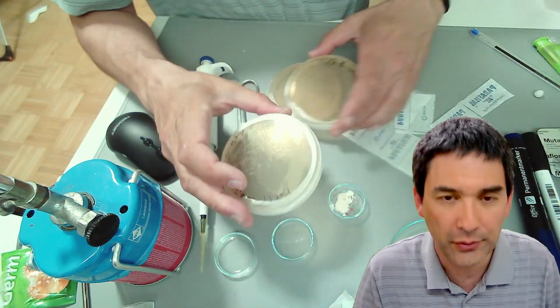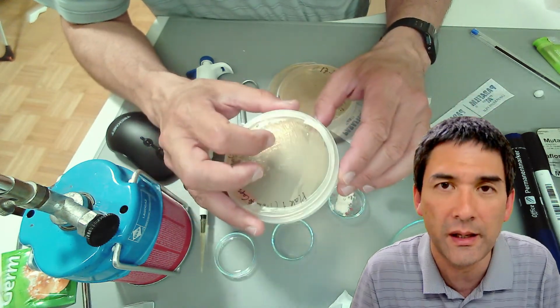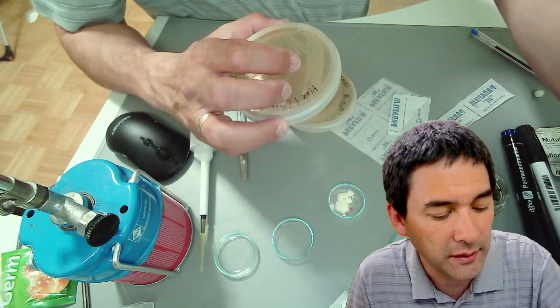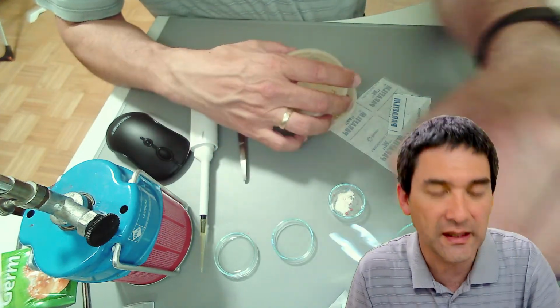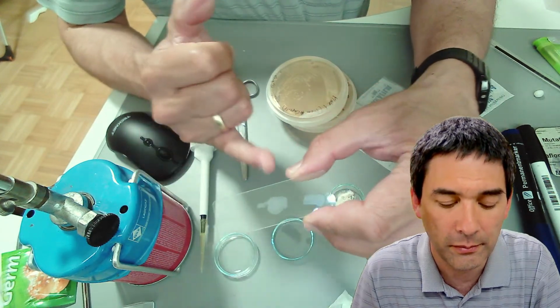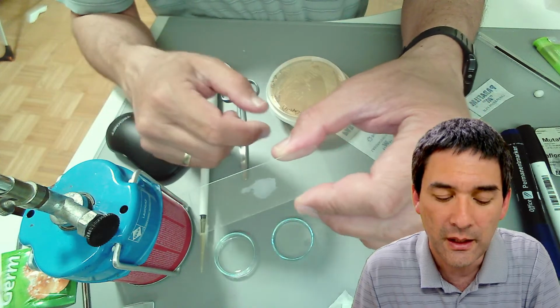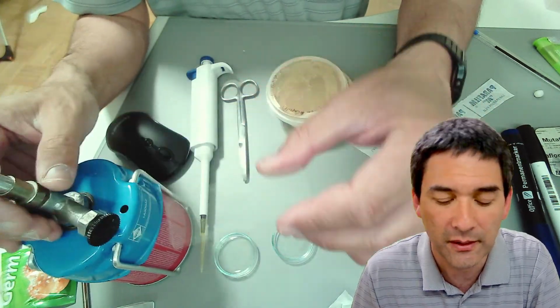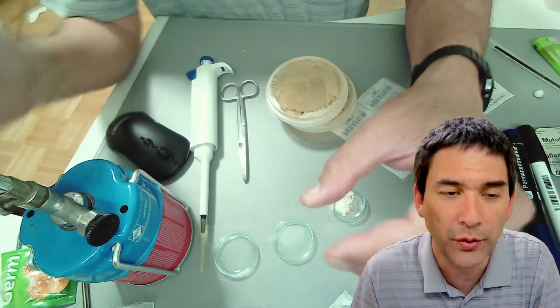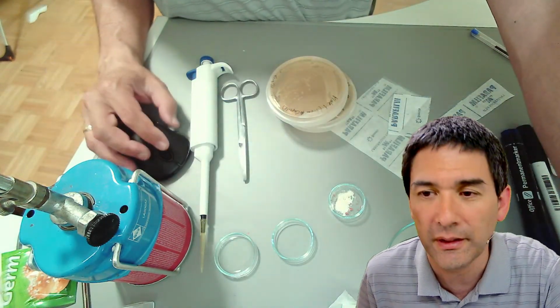And then I also put some of those bacteria under the microscope. I showed you how to make a so-called heat-fixed slide, by suspending some of the bacteria in a drop of water, allowing it to dry, and then heating it up over a gas flame. Then I was also staining it with methylene blue, and that's when we were able to see the different bacteria.